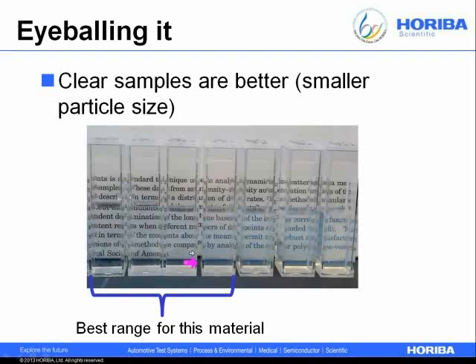Now once you have a measurement from a sample, at any concentration, you know how to set up a concentration study if you want to develop the method further.